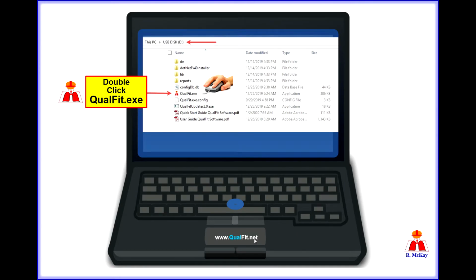From this window, what you'll do is double-click the file name qualfit.exe. That's the one with the logo next to it. Accept the end user license agreement if this is the first time inserting the QualFit software, and the main screen will appear.